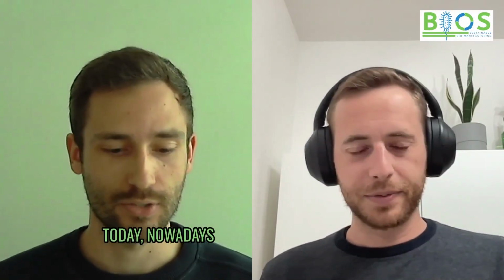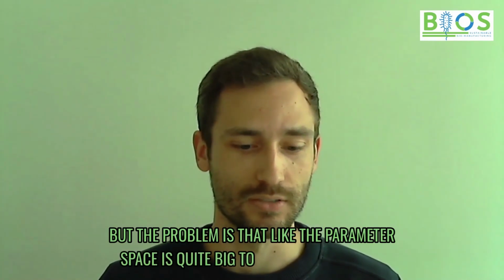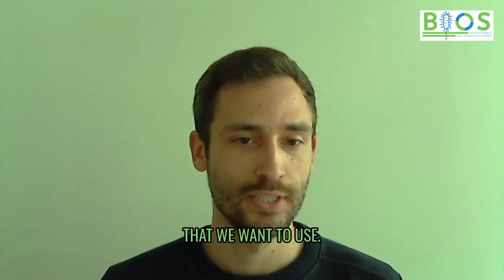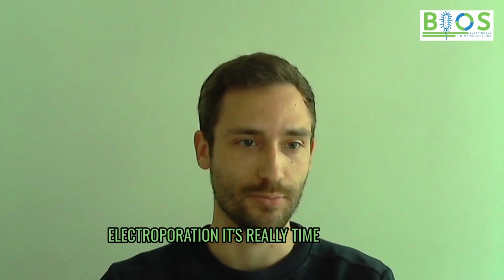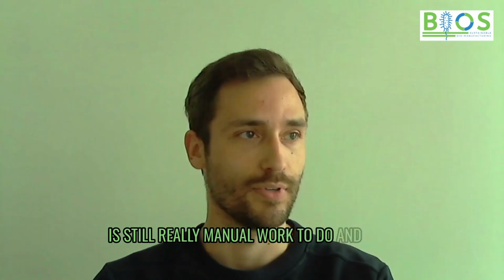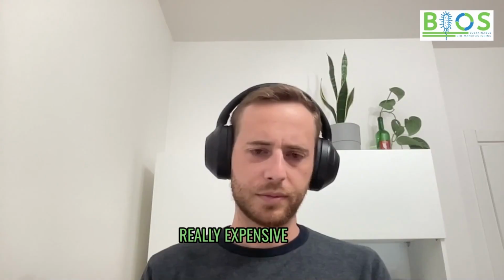Yeah, for sure. Nowadays, in biotechnology a lot of strain engineering is done, but the problem is that the parameter space is quite big to modify the strains genomically in the right manner so that they produce biochemicals or other products that we want to use. So the development of these strains is really time consuming, and especially when using electroporation, because in a lot of cases it is still really manual work. There are also some devices that automate these steps, but they use really specific consumables, which are really expensive.